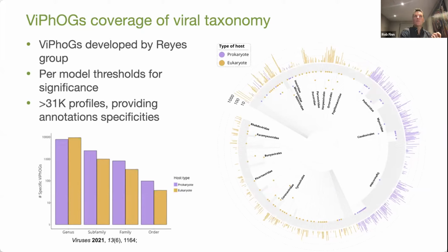So we can detect both prokaryotic and eukaryotic viruses, and we have reasonable coverage. And coming off the edge is the number of those Viromics that match that. Some areas aren't great, and that's purely because there aren't many sequences to build a sensitive profile HMM in that space. So not having enough examples of viruses is a key limitation.